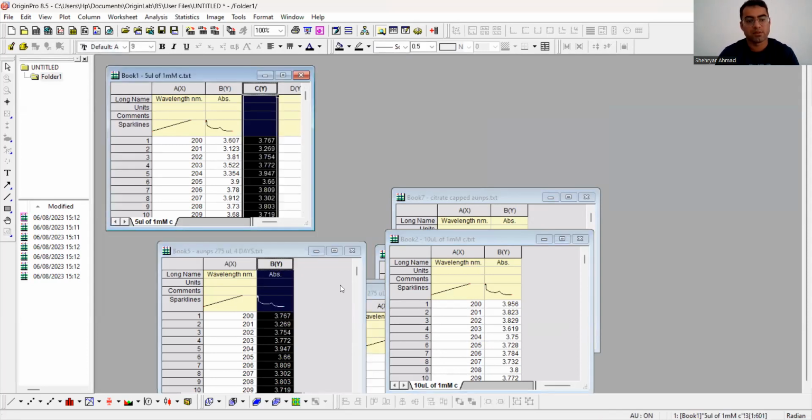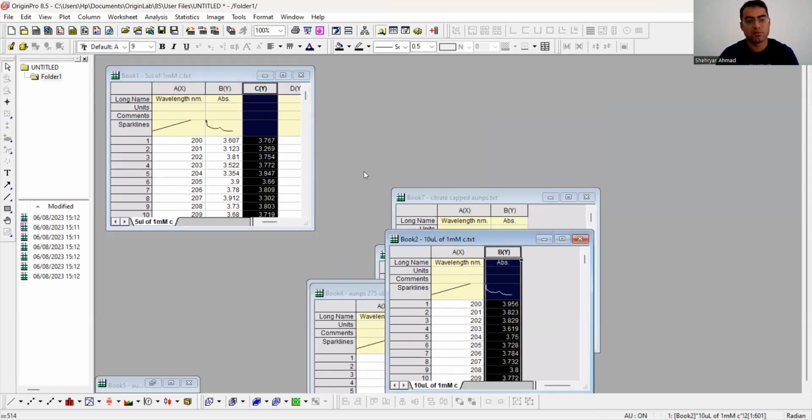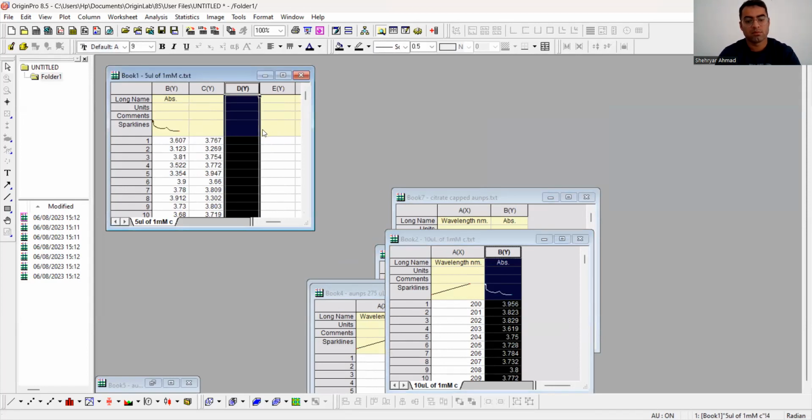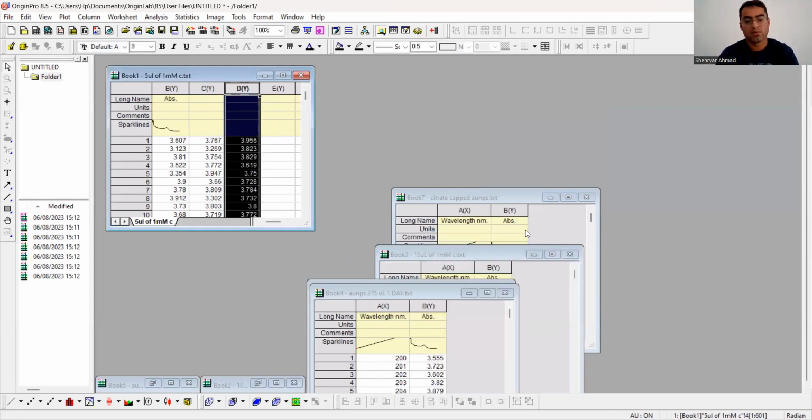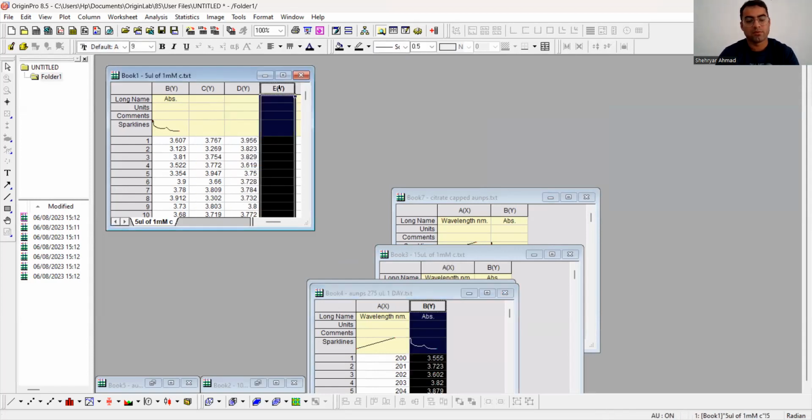We place here one by one. And be sure to copy each value once.